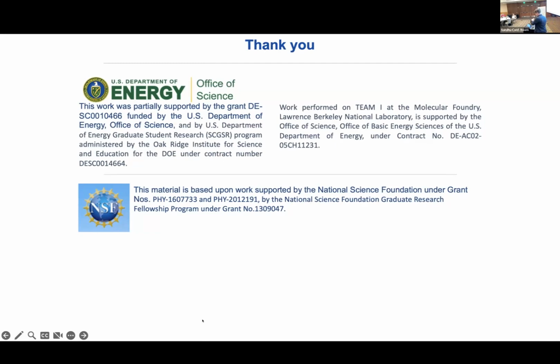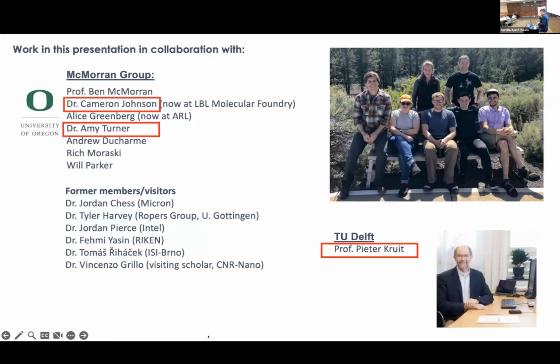Yeah, that's remarkably beautiful work. Congratulations. In the interaction-free measurement business, the problem still is that you have to hit the molecules half the time in order to do an image. Is there any way of improving on that?